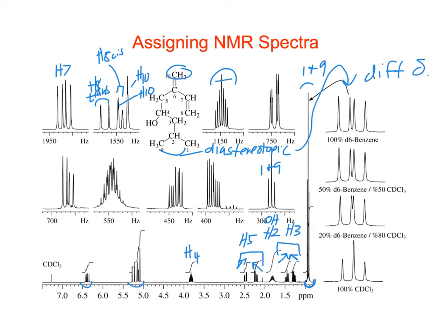All right? So some of the take-homes here are, for the double bond protons, we have bigger trans splittings, smaller cis splittings. Geminal couplings are very small, right? And then identifying these diastereotopic pairs of protons is important because if you've done many of these, you look at these and you're like, oh, those two must go together, and these two must go together because of the way they're kind of slanting towards each other. All right?